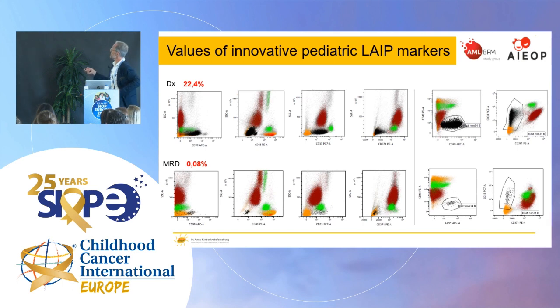It's, for example, the values, because they are really good. CD99, CD48, CD371 are really valid markers to follow, in combination, on the leukemic situation. So that is diagnosis and follow-up. You have good combinations, simply speaking.